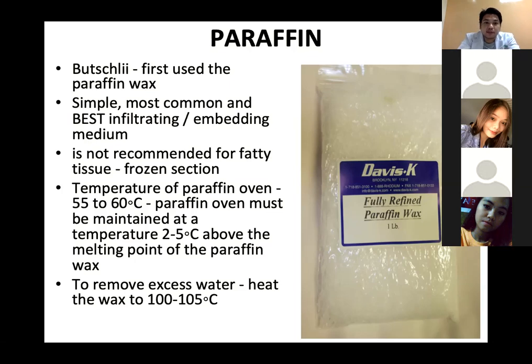It is not recommended for fatty tissues and for frozen sections. What is the reason why it is not recommended for fatty tissues? Class, with exposure to melted paraffin, fatty tissues become disrupted and the fat cells become degenerated. So we do not use paraffin when we perform the technique with fatty tissues.